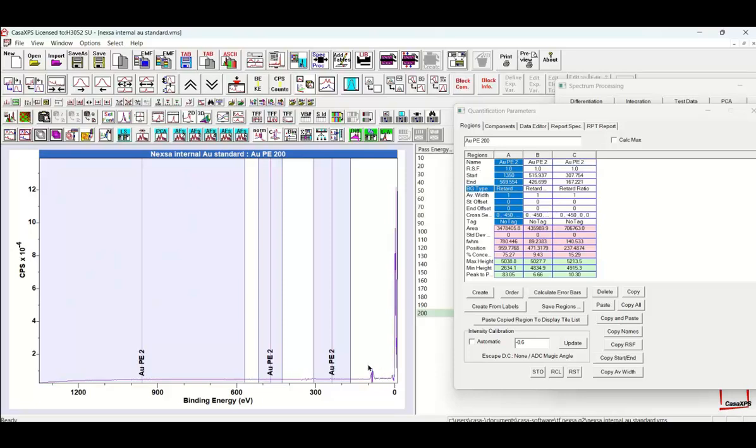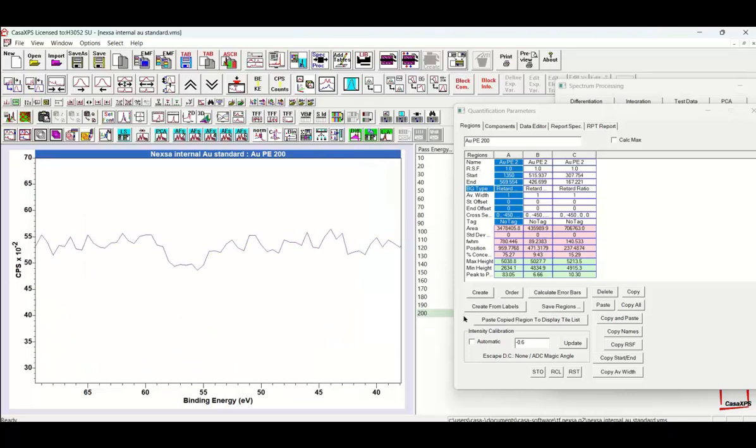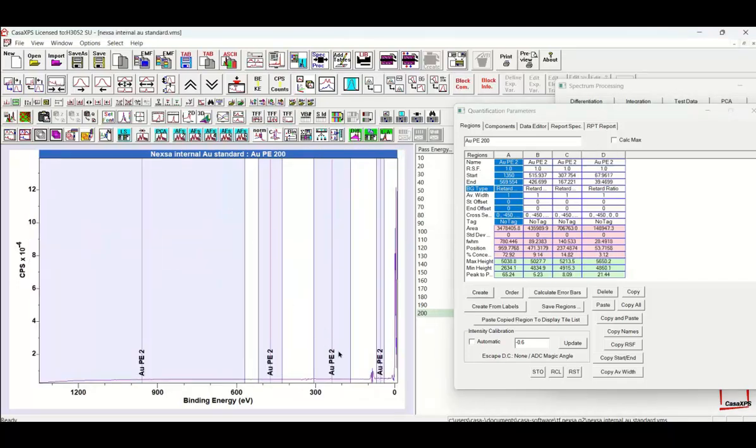And then finally I'm going to look into this area. I'd like to have some sort of region here. So I've got 4 regions I've got to find, and they're trying to span the entire energy range of these data.